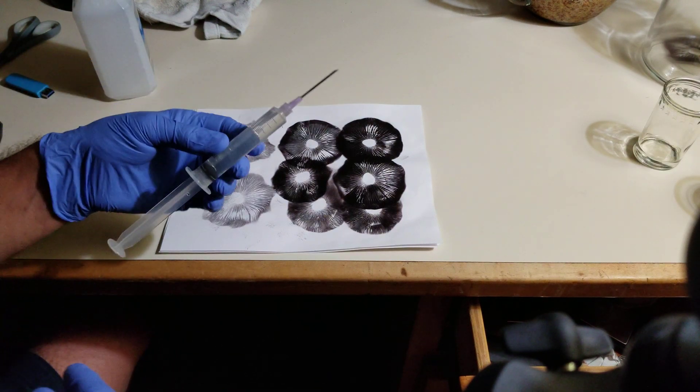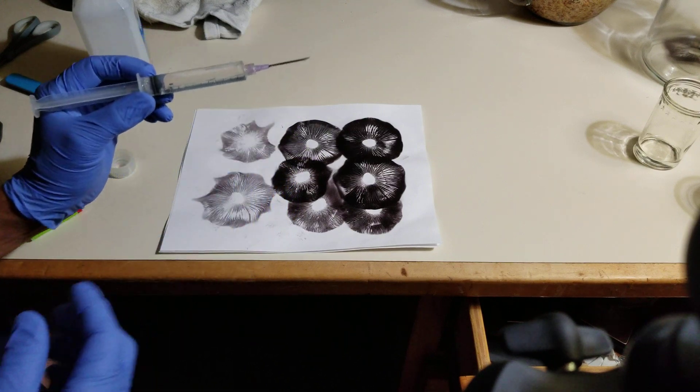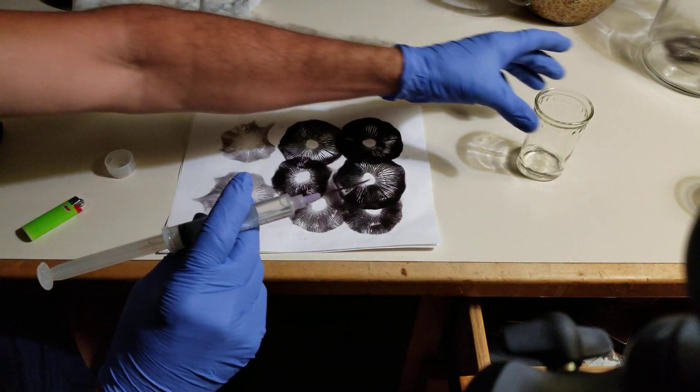Now that the needle is cool, the water in the needle and the syringe is cool, we're going to withdraw spores.